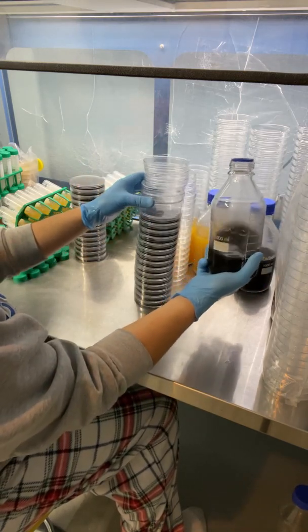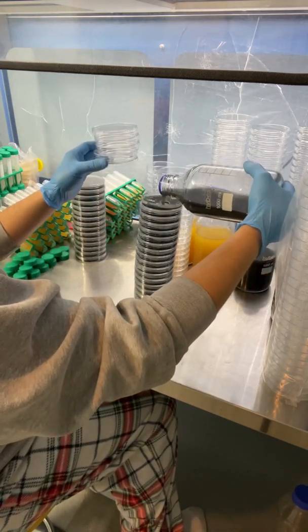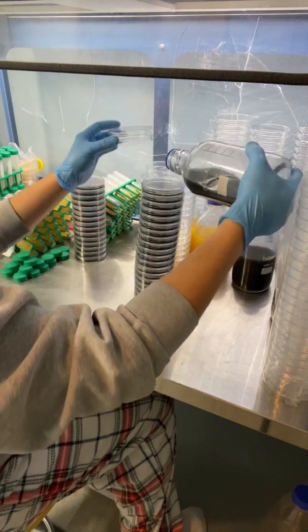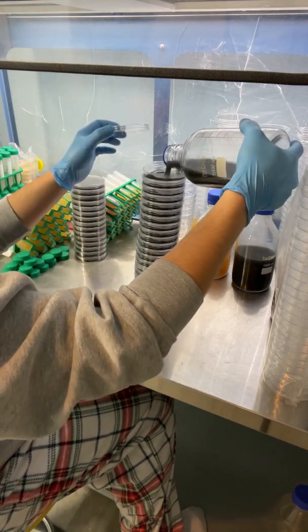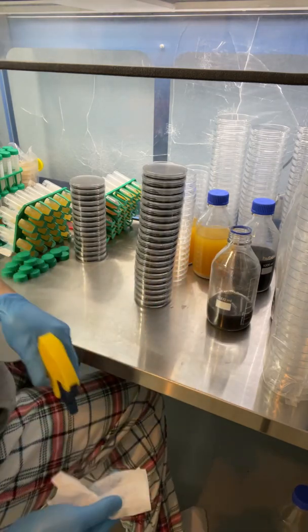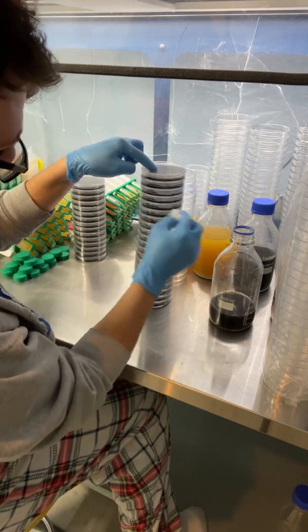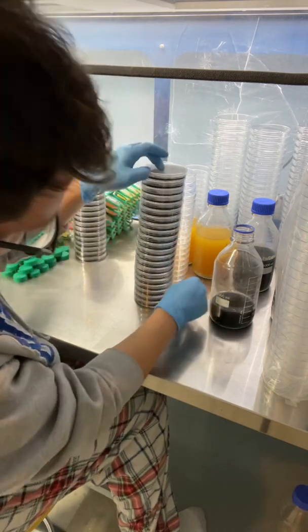So this is a black charcoal yeast agar. I did see a couple of drips right here — you really want to avoid that, but if you catch it early enough it'll be fine.